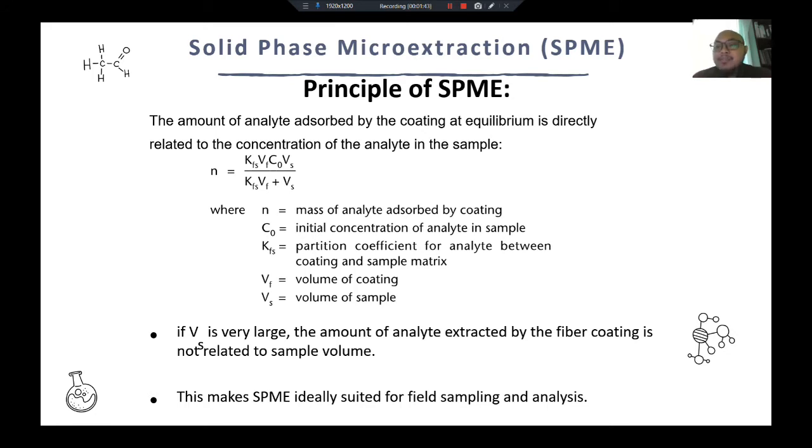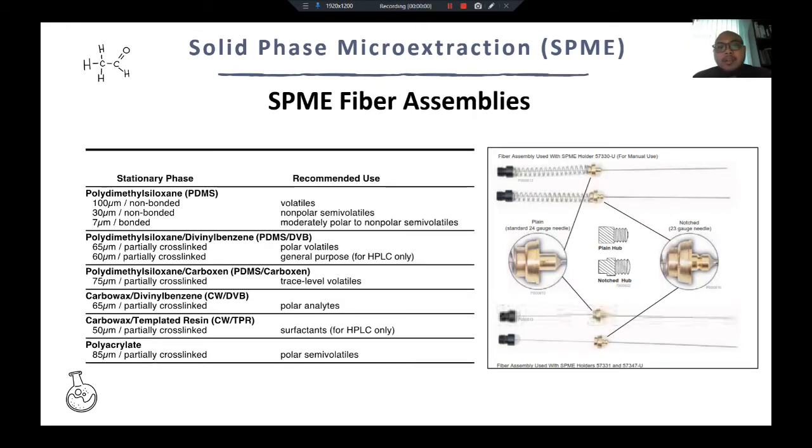Okay, saya pun masih lagi berkira sebenarnya untuk buat project on SPME, because it's quite expensive of the fiber lah. Sebab saya takut juga kalau kata rosak, mahal. Okay, I already showed you the fiber, right, the real one.